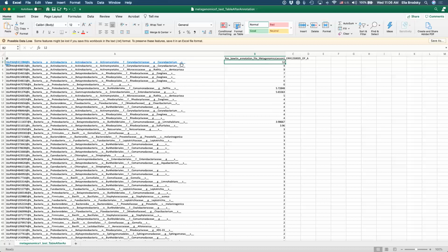If we go to a higher level of taxonomy, we could separate them by the different categories, and we can learn other things about the composition of this particular sample. Okay, so does that make sense? I know that this is still very basic, but the idea, I think, should be clear from this one single example.